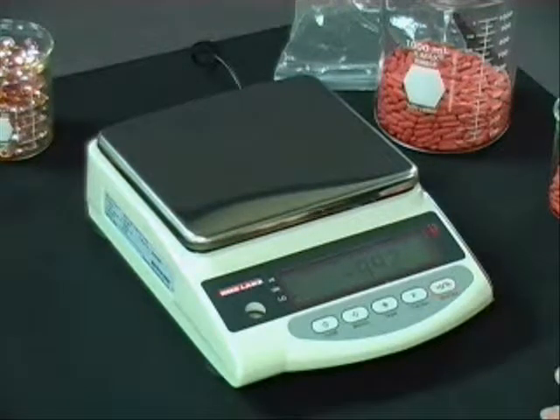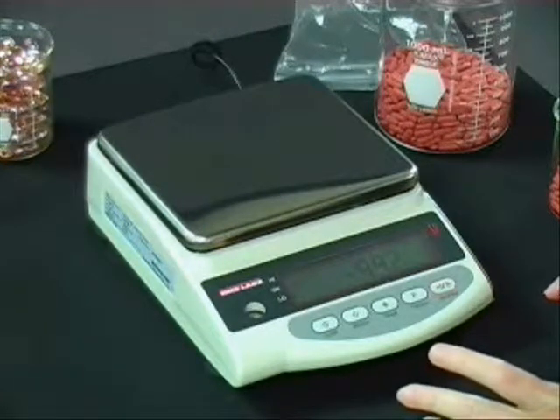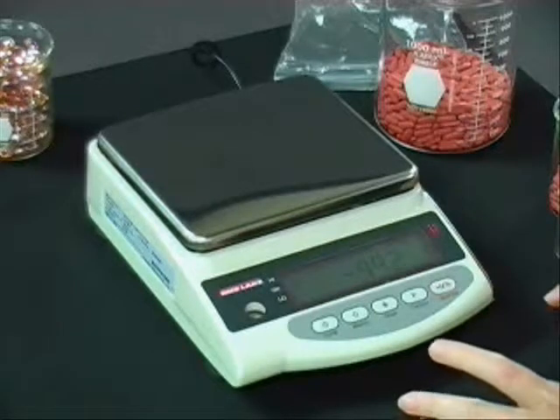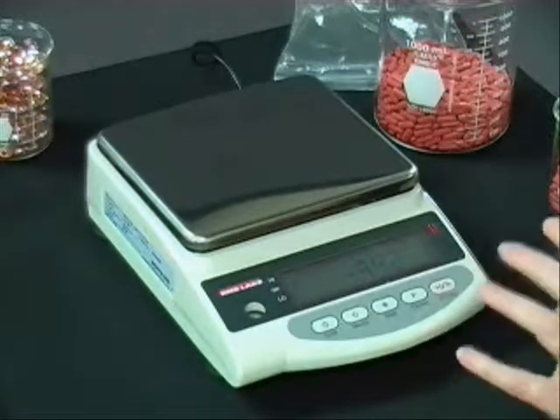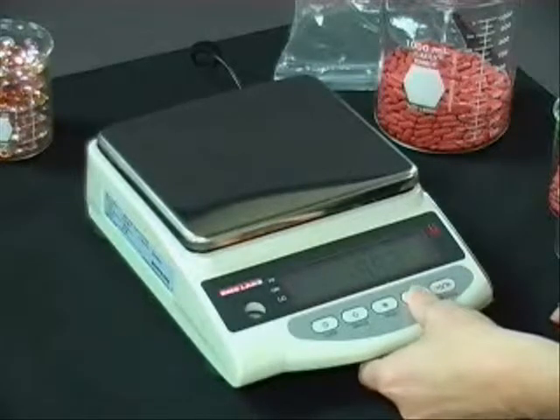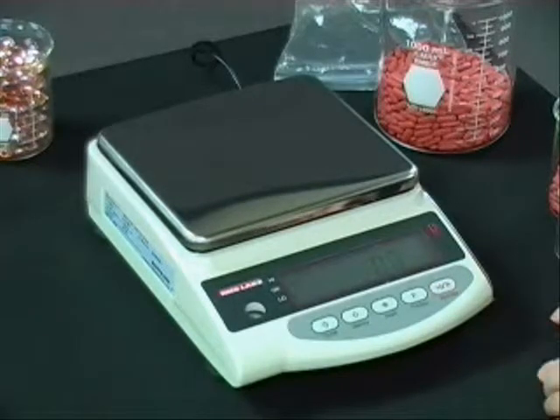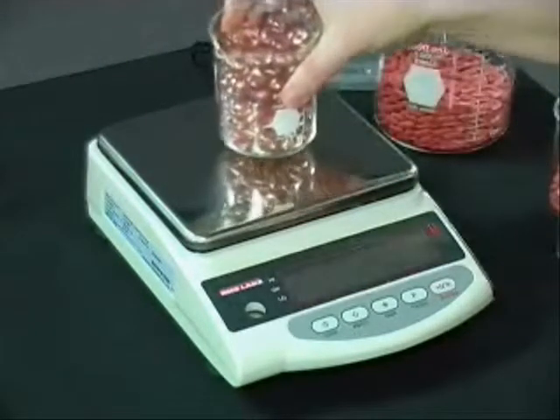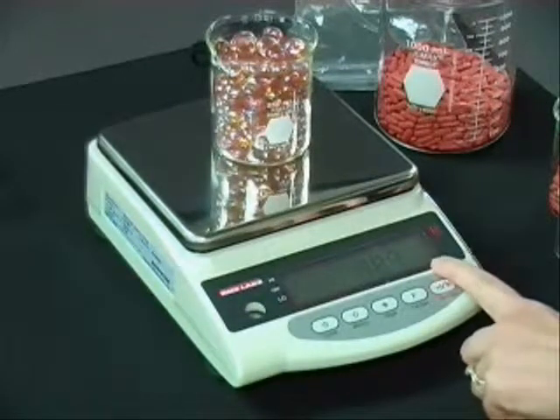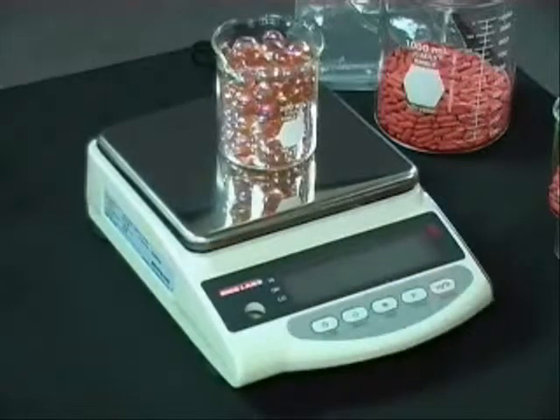Now we're going to weigh in percentage. There are different times when using a balance that you want different modes. There are times when you want to count out the exact number of items, and there are times when you may just want to know that your bottle is full — it's a hundred percent. So I'll go to the functionality mode of percentage and zero off my scale. I'm going to weigh my full container. I activated my percentage mode, and now I can press target, set my value, and push memory. It comes back and says it's a hundred percent.